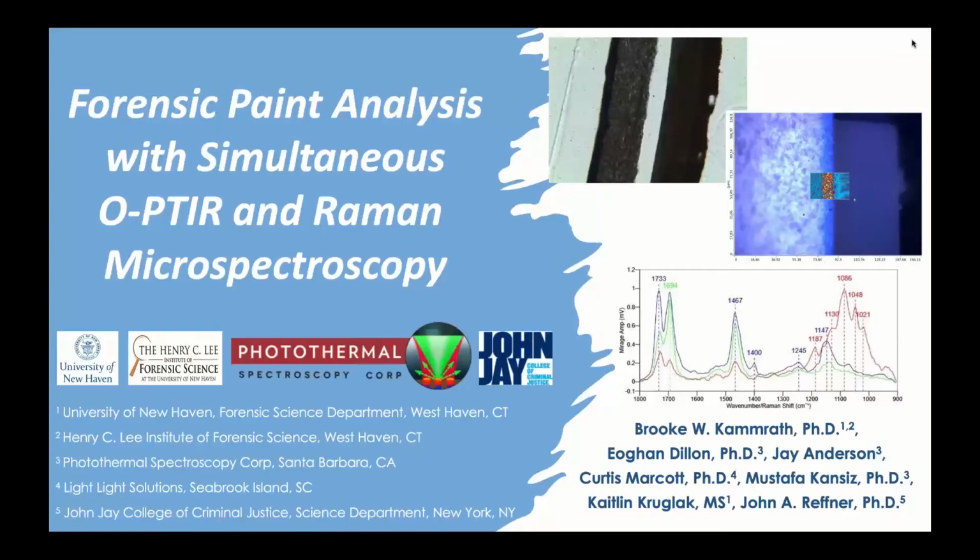Thank you, Mustafa. And thank you all for attending my talk on forensic paint analysis with simultaneous optical photothermal infrared and Raman microspectroscopy. I want to start off by thanking all of my co-authors. None of this work gets done in a vacuum, and we all work together to accomplish our goals.